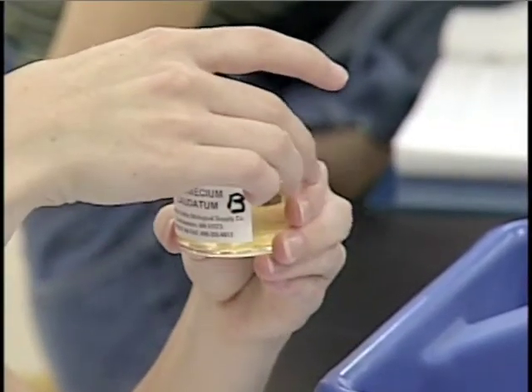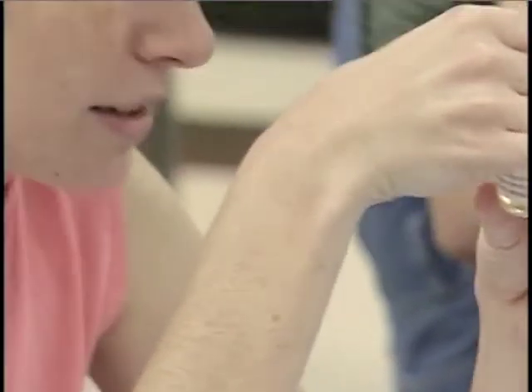Maybe we could get a dissecting microscope, since we need to use both a dissecting and a compound microscope.